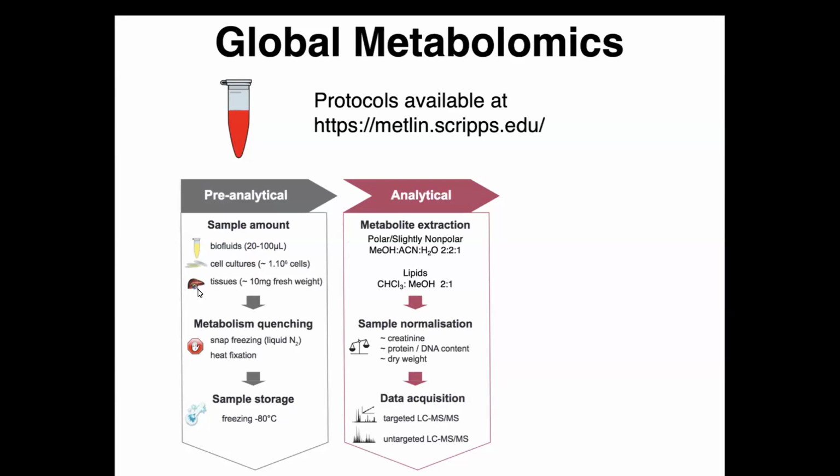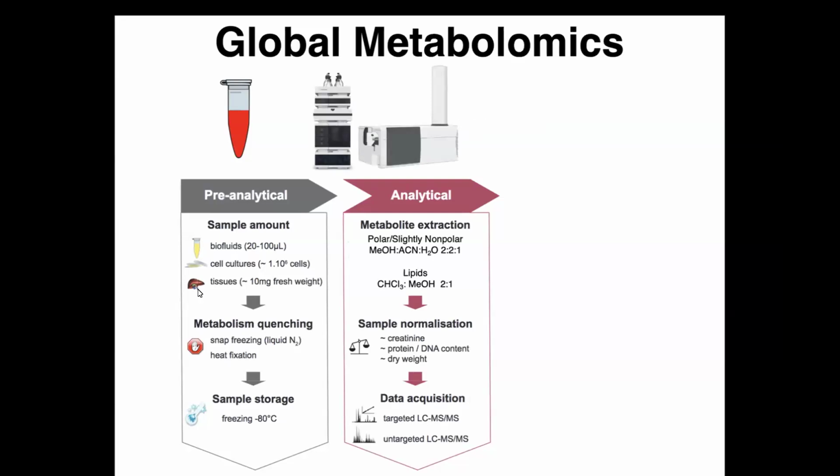The next step is data acquisition, or LC-MS analysis. The extracted samples are analyzed on a UHPLC coupled to a Q-TOF. For non-polar metabolites, the LC-MS analysis is performed by reverse phase in both positive and negative ion modes.